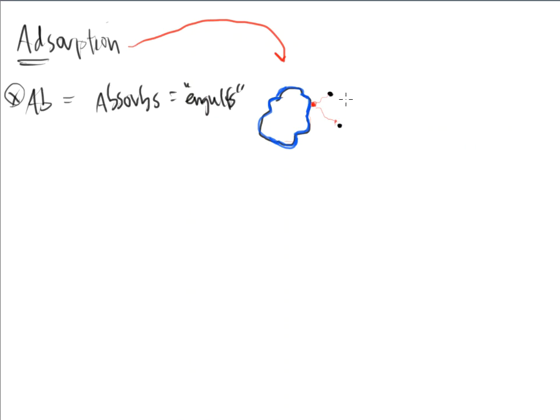And that's kind of adsorption at its best, right? So in the field of HPLC, UHPLC, LC, most of the time adsorption is taking place in those types of instruments or pieces of equipment. TLC is also adsorption, and there's other methods of chromatography out there too that play off of adsorption, just like packing your own column would do, right?